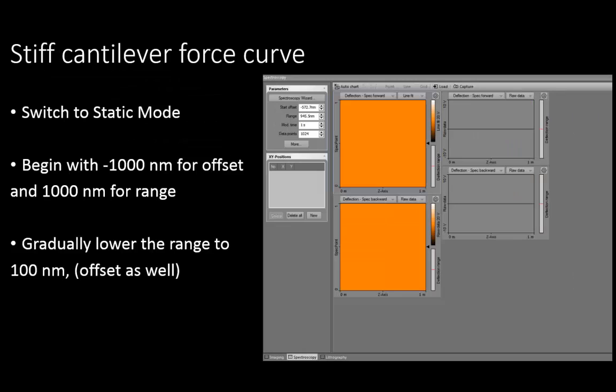Go back to spectroscopy and upload the image you obtained in phase contrast mode. Switch back to static mode and set the start offset and range as before and obtain a force curve. Your data will probably look like a horizontal line or just noise, so you have to gradually lower the range and probably the offset as well. Look for adhesion and attraction so that you know that you have obtained good data.